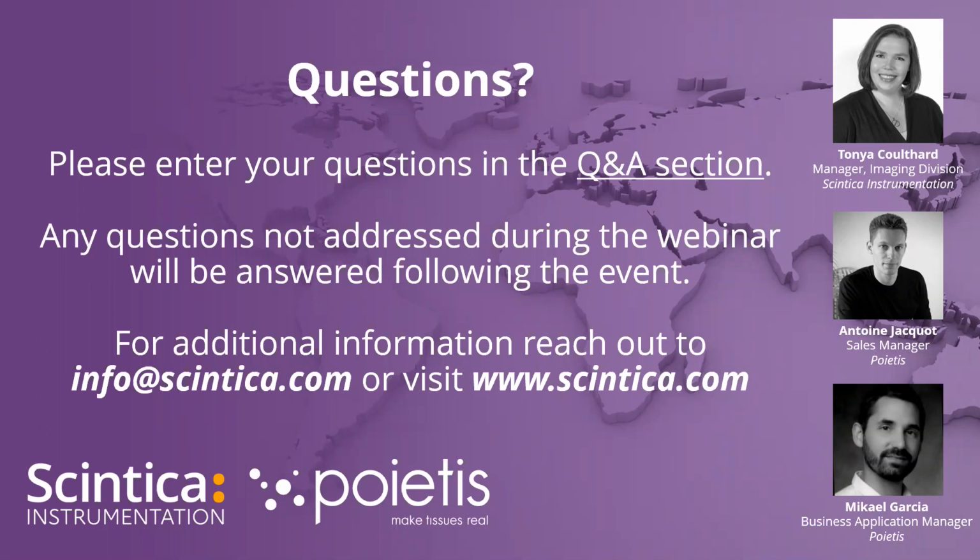I'll take a stab at answering that, but again, if you guys want to add more. The team at Poietis, as they've discussed with me, spent a lot of time picking what metal would be used for that metallized substrate to ensure that there wasn't heat generated when the laser hit it. That's where gold is used, sputtered onto the glass cover slip. As the laser hits the gold, there's enough energy released to release the droplet, but it doesn't create heat. Therefore, there's no damage to the cells or risk of heating the cells or material in that process.